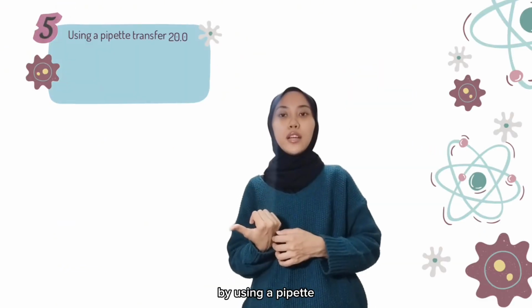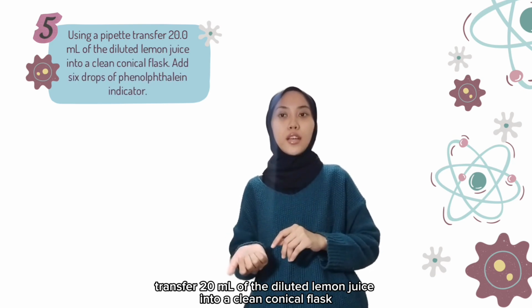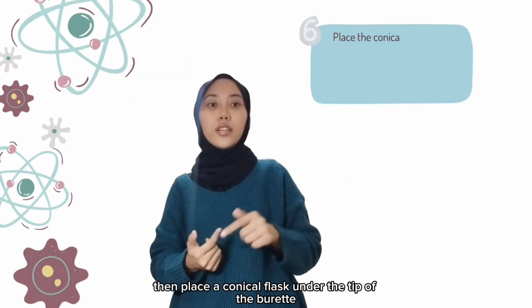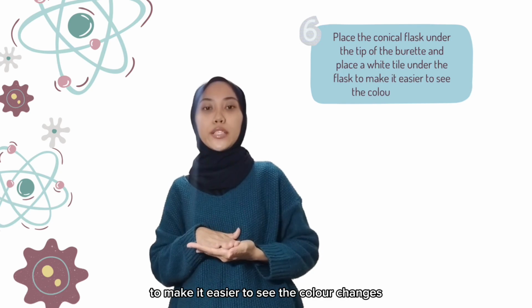By using a pipette, transfer 20 ml of the diluted lemon juice into a clean conical flask. Add 6 drops of phenolphthalein indicator. Then, place the conical flask under the tip of the burette and place a white tile under the flask to make it easier to see the color changes.